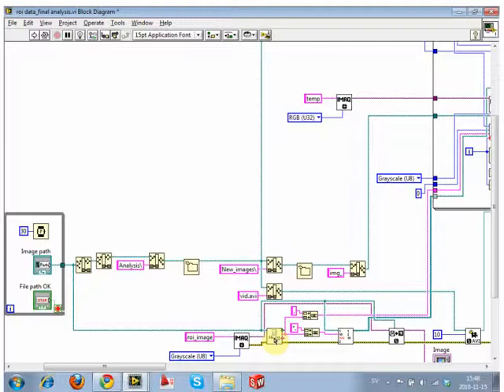So rather than saying star.jpg is my filter, you can set it to, I chose a file path. It strips that file path to tell me what the file extension is. I then add a star dot to that file extension and then filter on that. So whatever file type I chose, that's the file type you want to work with. If I chose bitmaps, do bitmaps. If I chose JPEGs, do JPEGs. So all these text files, LEI files are never analyzed. They only ever analyze the image type that you clicked on. It just gets out of the need for having a filter name.